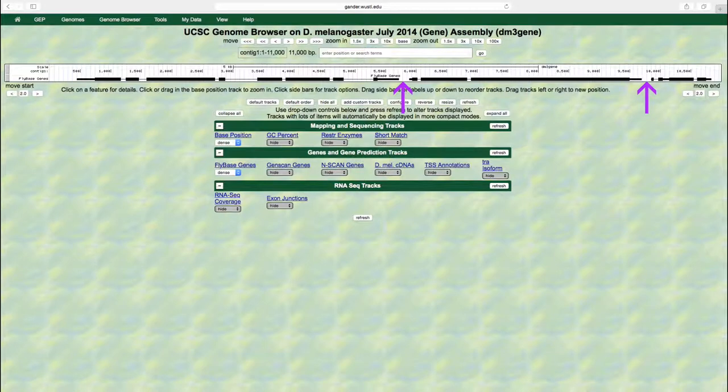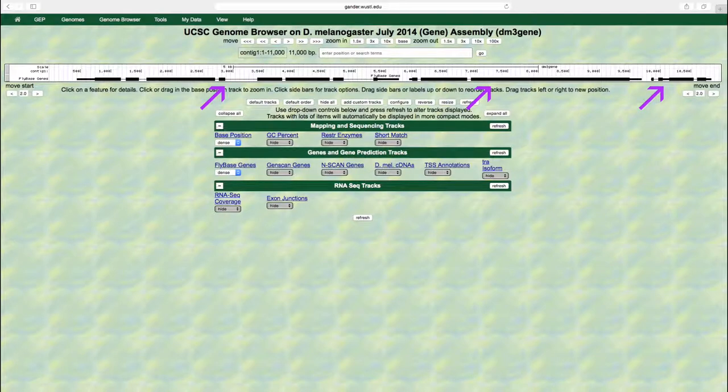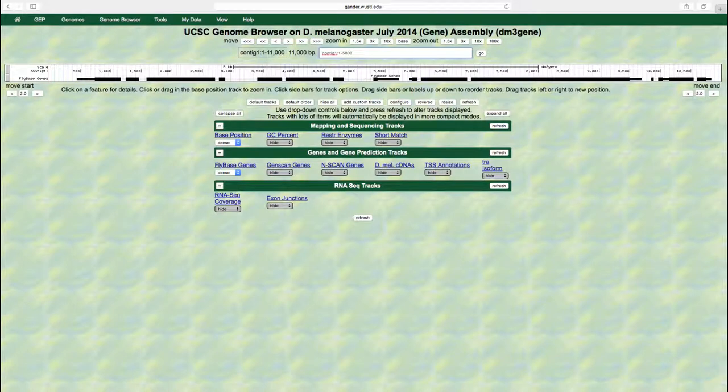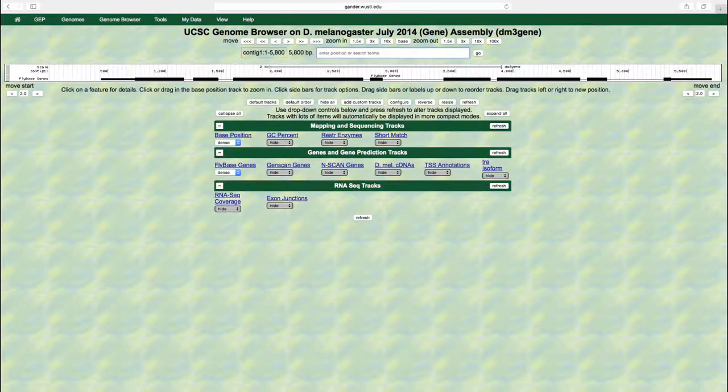In this example, contig1 contains three different genes and each gene has multiple exons and introns. Type contig1, 1-5800 into the search term box and then press enter to zoom into the region where the first gene is located within contig1.